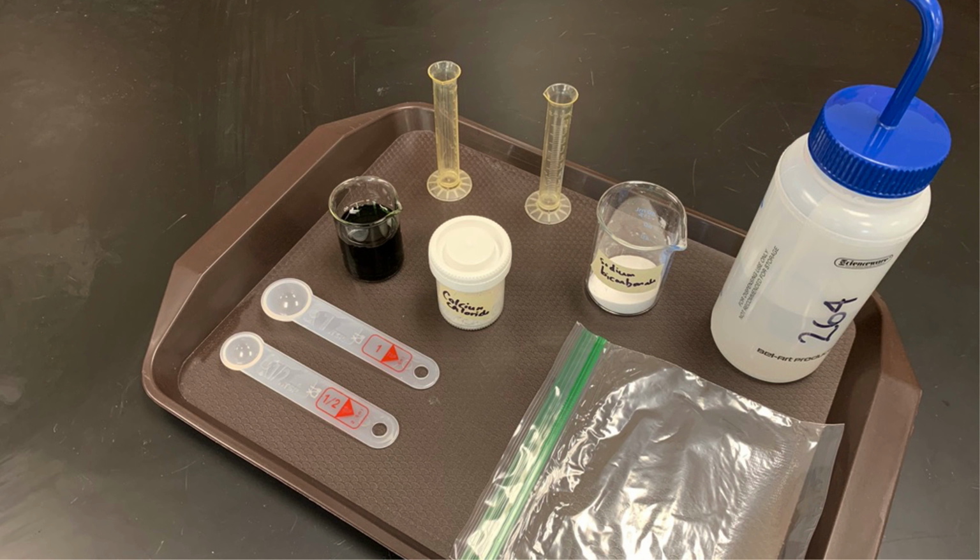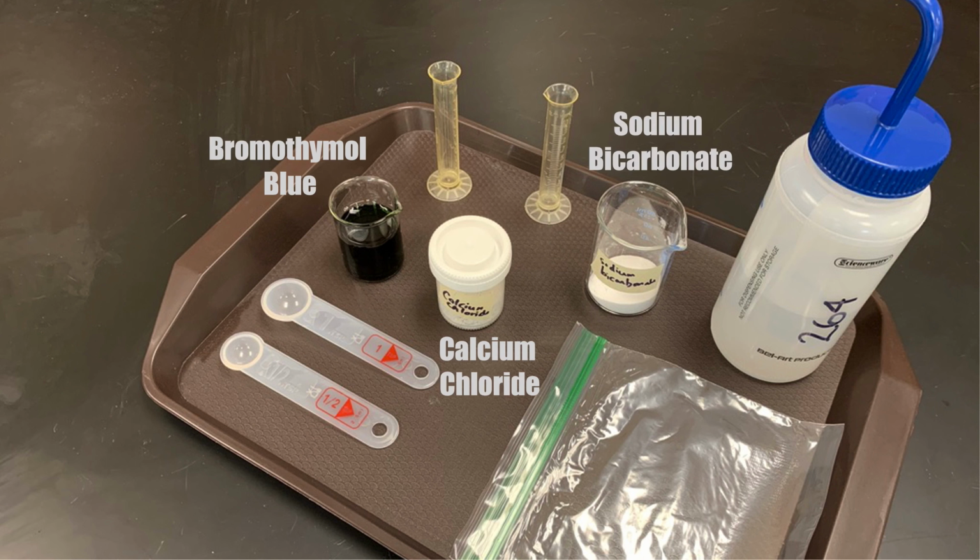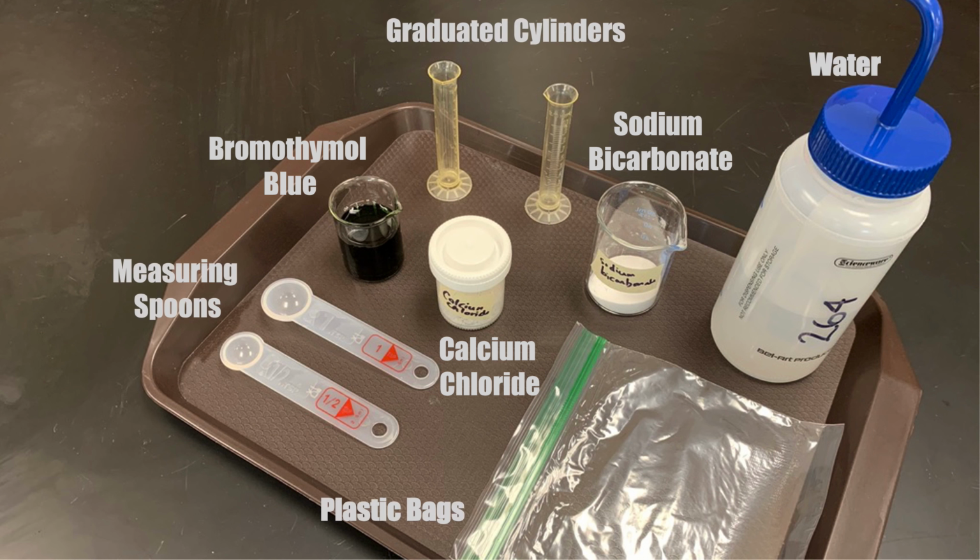So the next thing that we need to look at is what are the materials that are used for this lab. So you need bromothymol blue, calcium chloride, sodium bicarbonate, water, graduated cylinders, measuring spoons, and plastic bags.